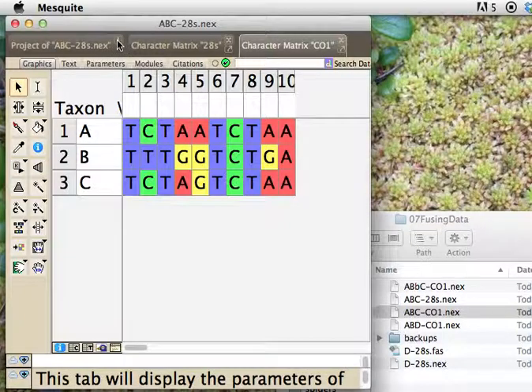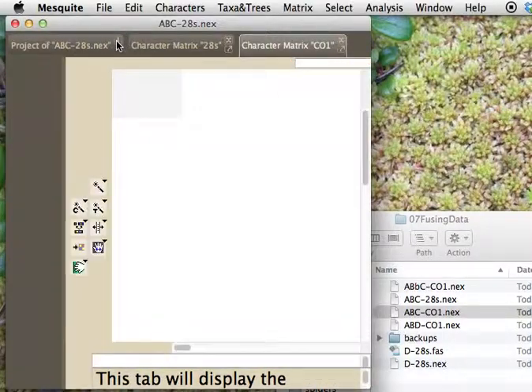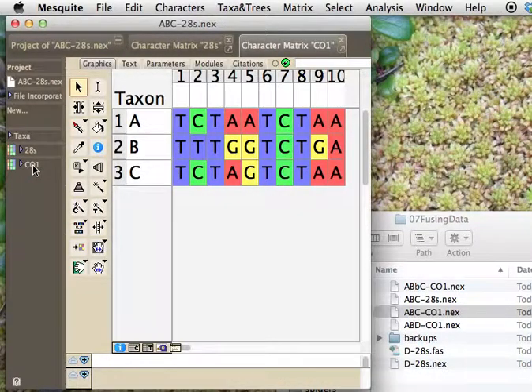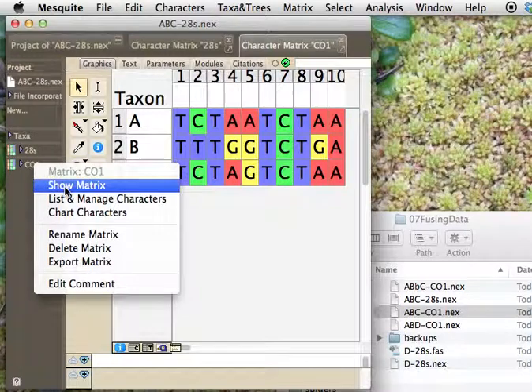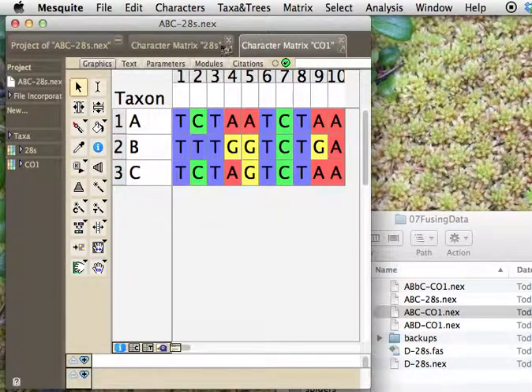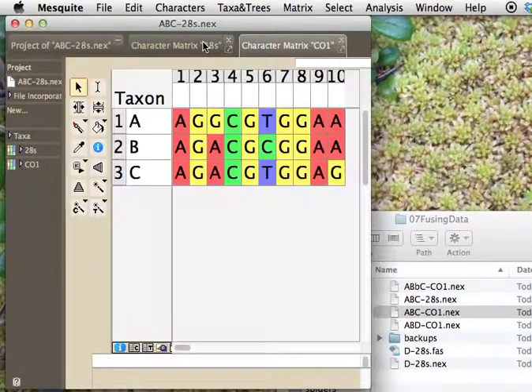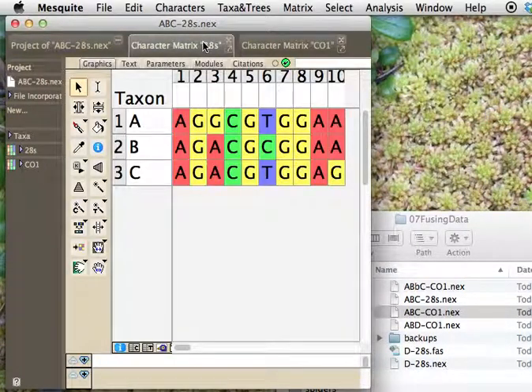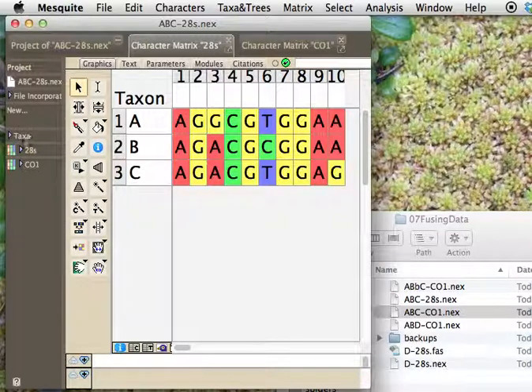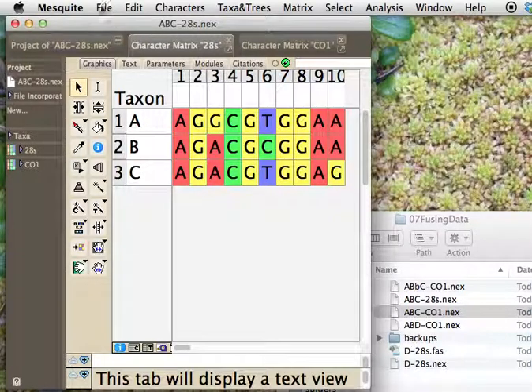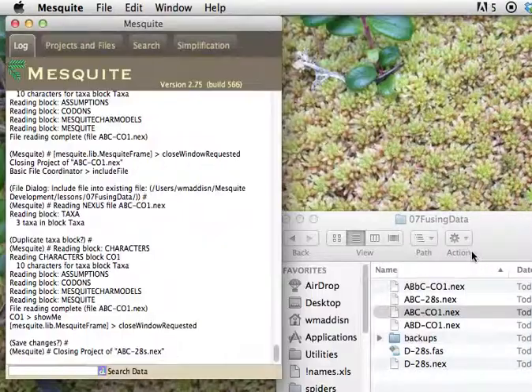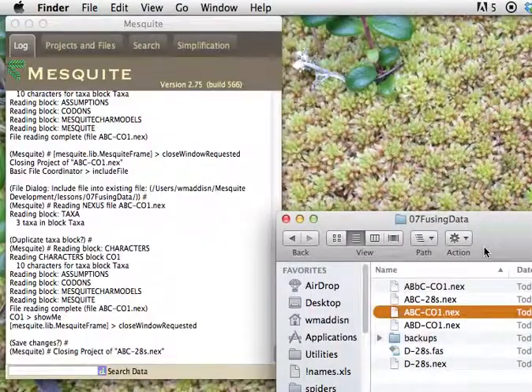And we look to see what we've got, and indeed we've got the two matrices now. Here is the CO1, and here is the 28S. So we've succeeded in getting them both, and they're listed as the same set of taxa. That's all fine and good.